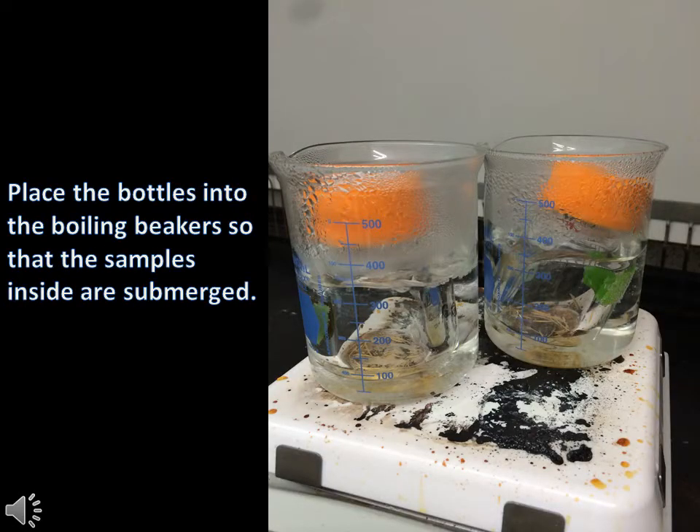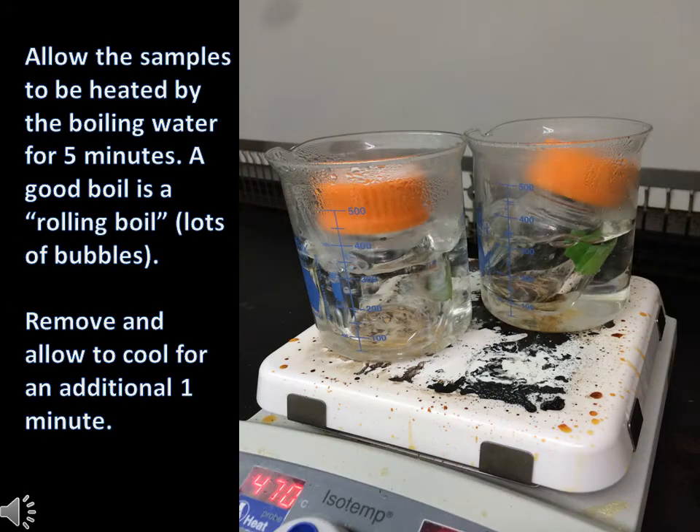Place the bottles into the boiling water so that the samples are fully submerged. Allow the samples to be heated by a rolling boil for about 5 minutes. After, remove the samples and allow them to cool for an additional minute.